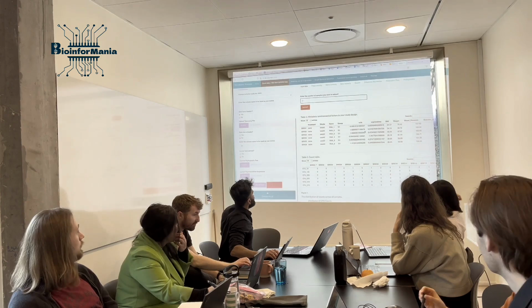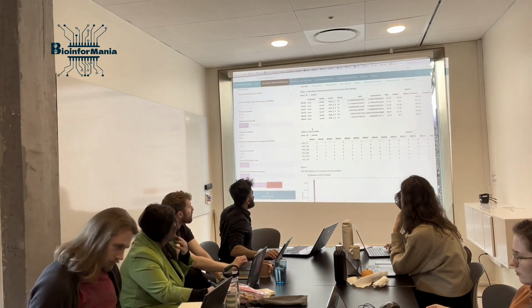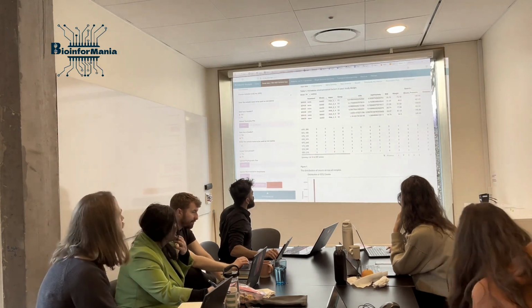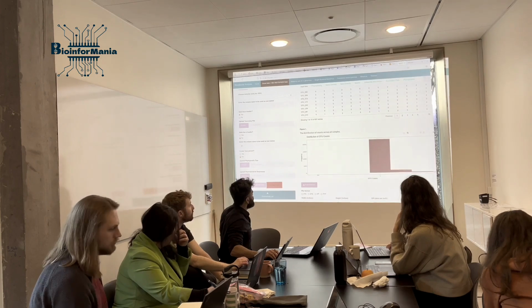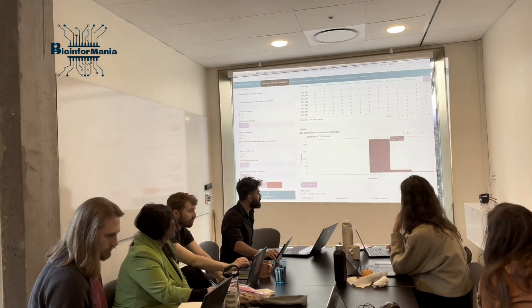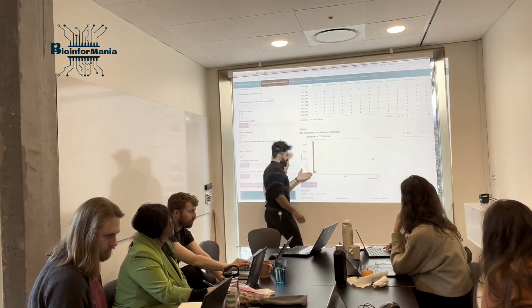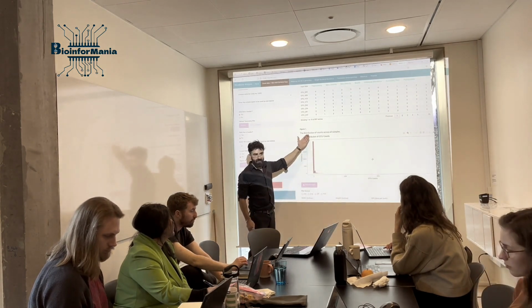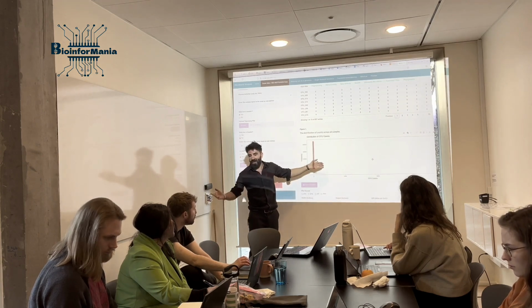This is an overview of your metadata. You can sort them. You can search for whatever. You have an overview of your count table. And a basic plot of the distribution of your counts, basically. And you can see how tailed this data is. That's what I was talking about. It has a lot of zeros. There are a lot of taxa that haven't happened in many samples, and some of them happen.